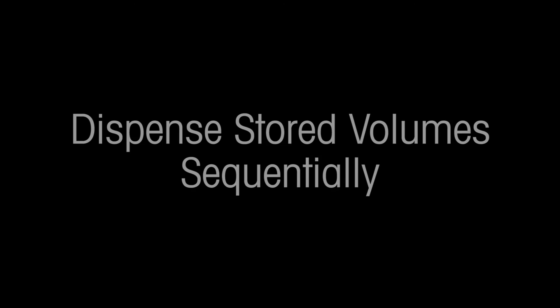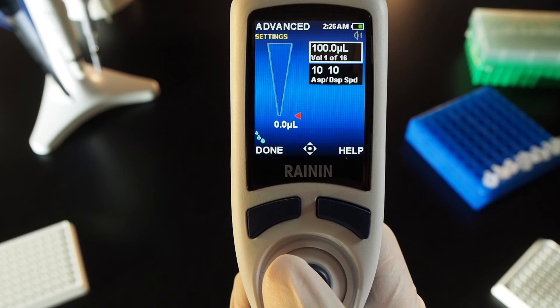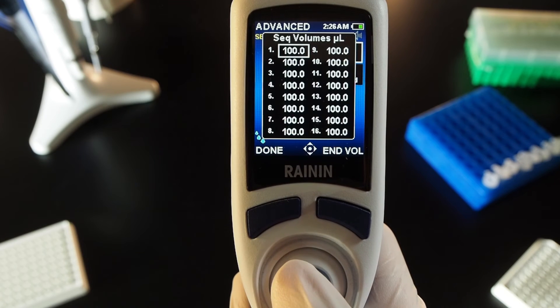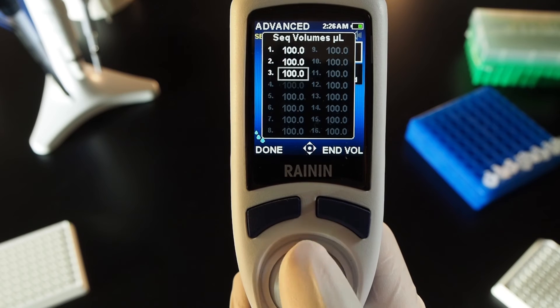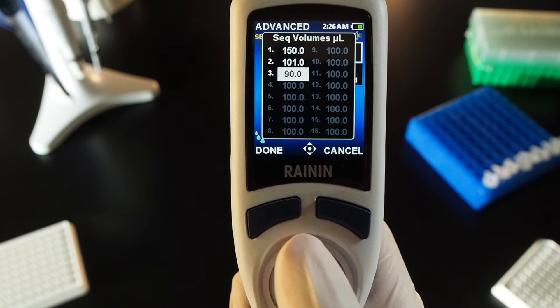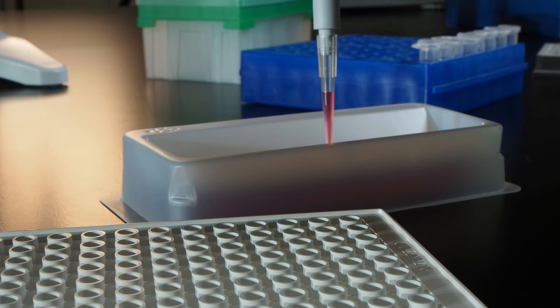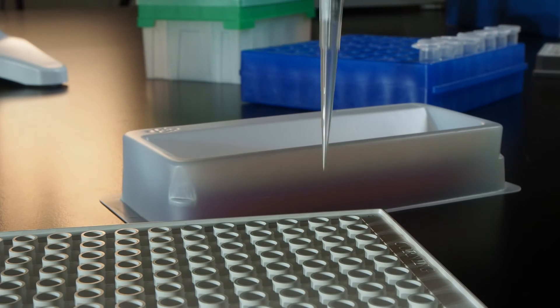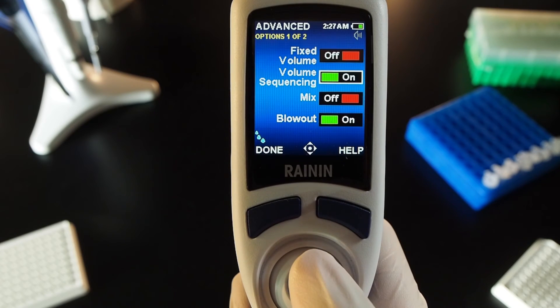Dispense stored volume sequentially. Dispense volumes in a series without returning to the list of volumes between each cycle. In options, joystick to volume sequencing and press the joystick in to turn it on. Press done. Joystick right to go into settings. With the top box lit, press the joystick in. A list of sequence volumes opens. Joystick to the last volume you want to dispense and press end volume. Use the joystick to go to different volumes. Press it to select a volume and adjust by moving left, right, up or down. When volumes are set, press done. Press done again to begin the volume sequencing. Joystick up to aspirate and down to dispense. Repeat through each volume in the sequence. Press options and press the joystick in to turn off volume sequencing.